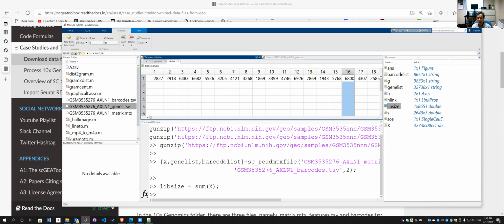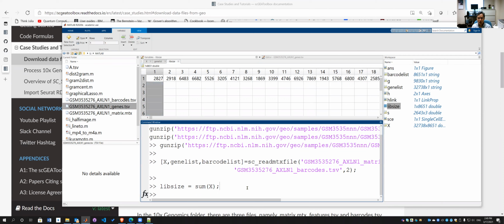Technically, because of random effects of the sampling, we are more successful in measuring the number of reads in some of the cells, but not the others. So we want to look at how severe this problem could be.